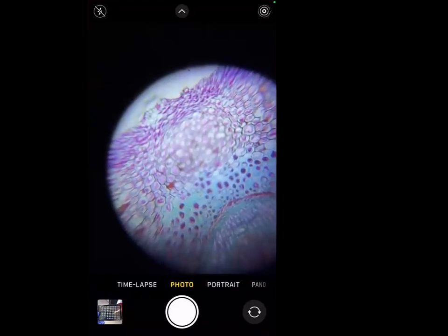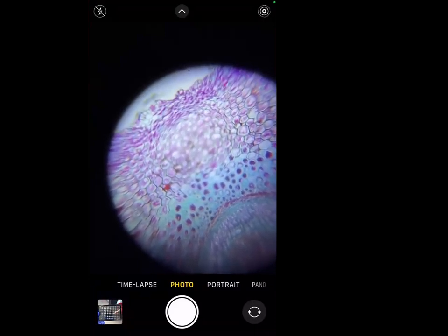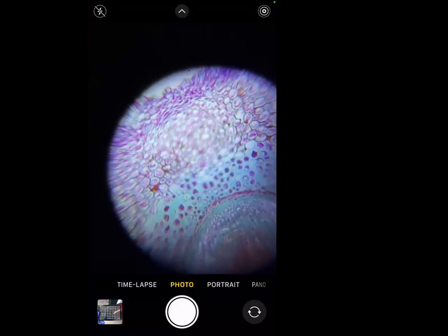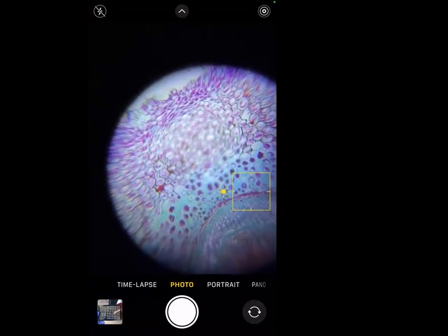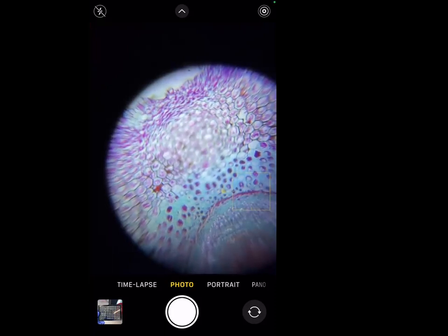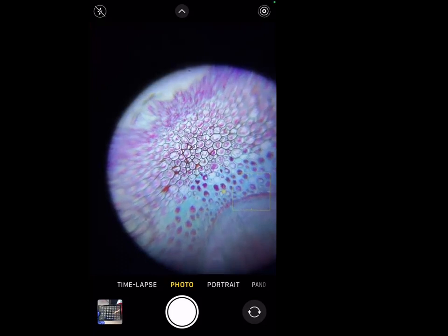Yeah. So I'm just projecting my camera screen onto Zoom, and as you can see, we can see the sample, but there's a hazy spot at the center, right? The reason is I have to focus using the wedge. So if you look at the other display, you will see I'm holding the XY stage with my thumb like that, and I'm pushing the wedge just a bit. As I'm pushing, I can bring the center to focus. Can you see it focus now?